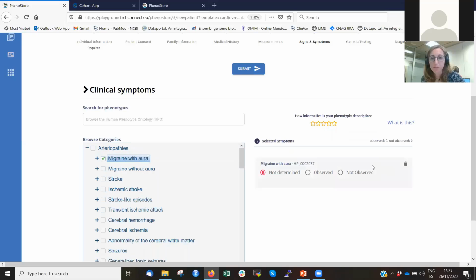Okay, thanks, Birte. We have another question from Estrella. Will it be possible in the future to push data from Phenostore to Phenome Central? We have not directly thought about this, as we use Matchmaker Exchange, and Phenome Central is one of the links we have in Matchmaker Exchange, so our data is discoverable in both sites. So I don't think we will be having this functionality specifically from Phenostore, but you would have the same application using Matchmaker Exchange through the genomic platform.